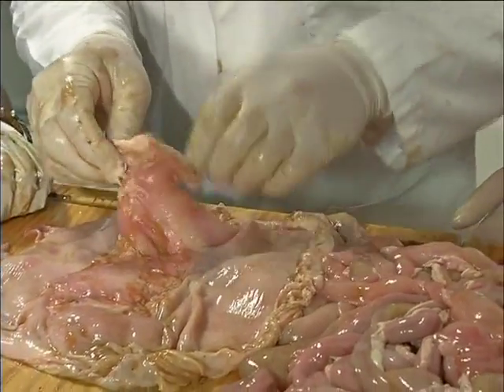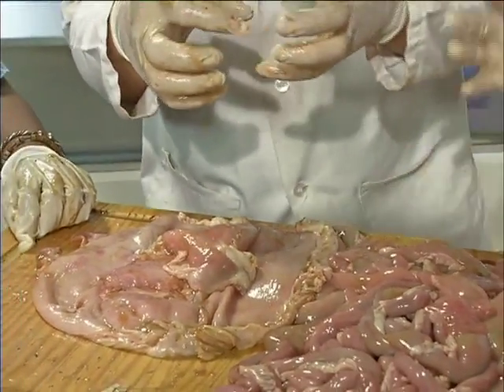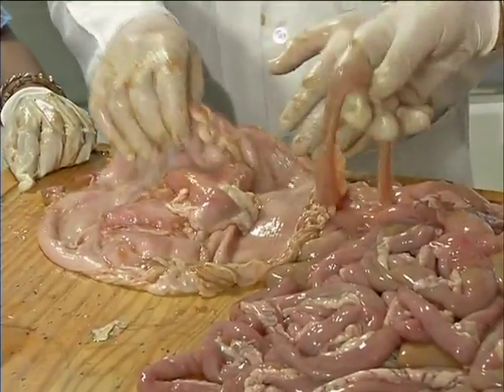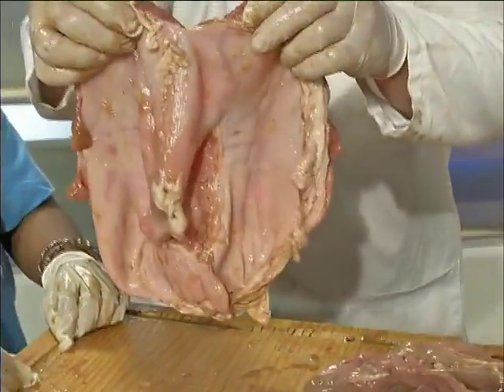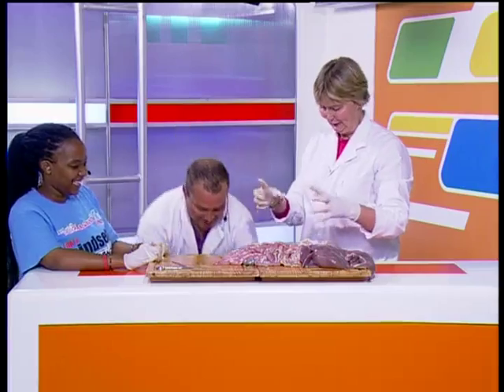Do you know what it's called, Tara? That layer that keeps everything together. It keeps all the organs inside, all the organs in one piece. It's a peri something, peritoneum or something. That's it. Very nice. I'm going to put this away. Hopefully you enjoyed it. The wiggly stuff now. Yes, now it comes to the wiggly stuff.